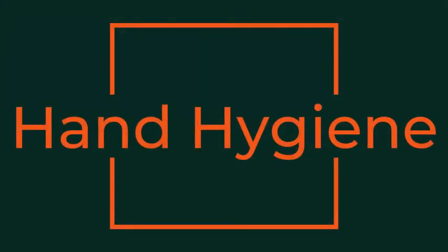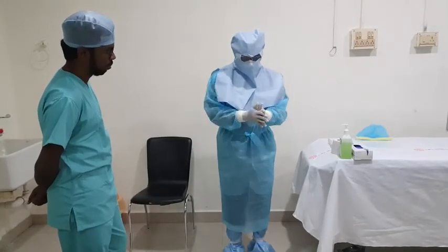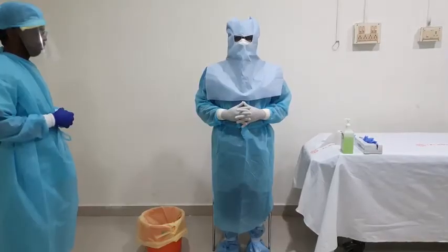Before moving to the doffing area, it is advisable to perform hand hygiene with an alcohol-based rub over your gloved hands. Remember that all your personal protective equipment is now contaminated. It is ideal to engage a trained observer to ensure the integrity of the process.